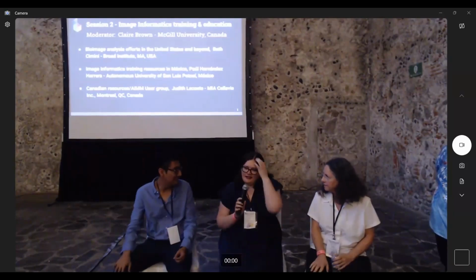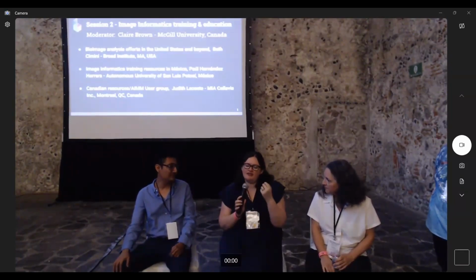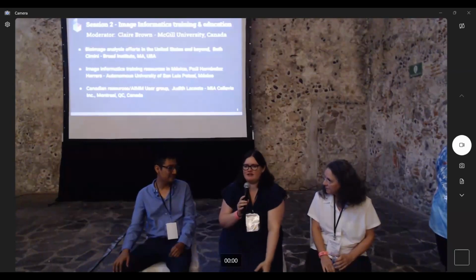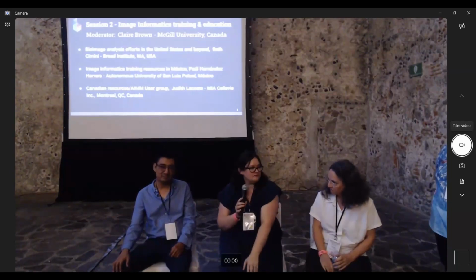Yeah, and I really think that this is where the role of the imaging core, in my opinion, comes in, because these are people that by the time the images are made, the scientists trust them, as well they should, because these are experts helping them out. And so I really think that imaging core folks can hopefully bring more analysis into their cores, but even if not, can be consultants to tell the end user, hey, you might need to change this for your analysis, or your analysis would be fine, you just need to switch tools.